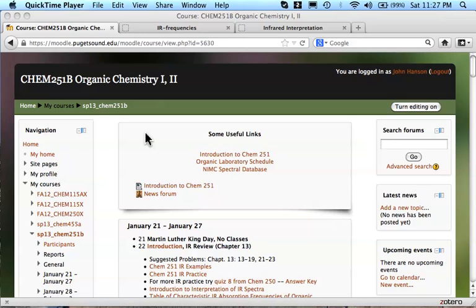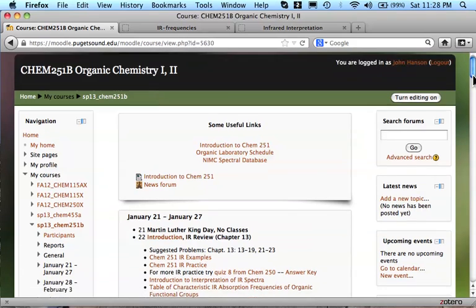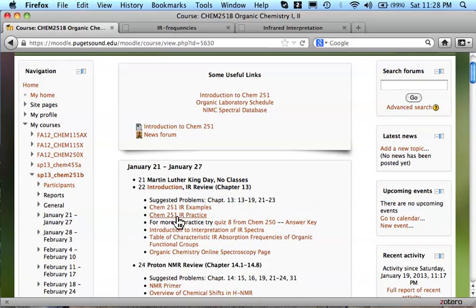I also assume you're watching this on a computer, and you might want to have the Moodle page for the course open like we have on the screen right now, so that you can click on things and look at stuff as I describe it. So with that in mind, the first thing that I would suggest you do is scroll down on that first page and look where there's a link to Chem 251 IR examples.